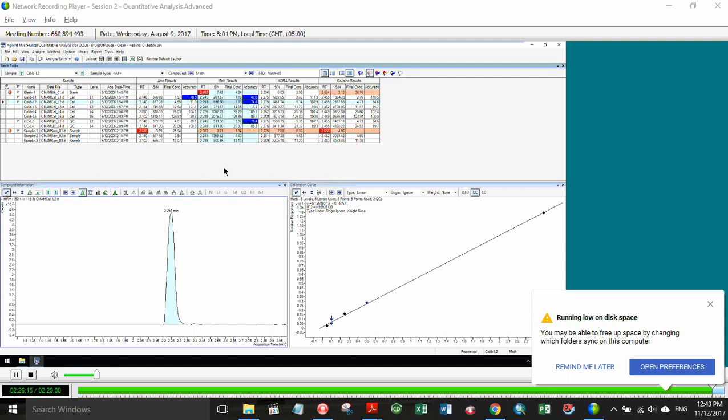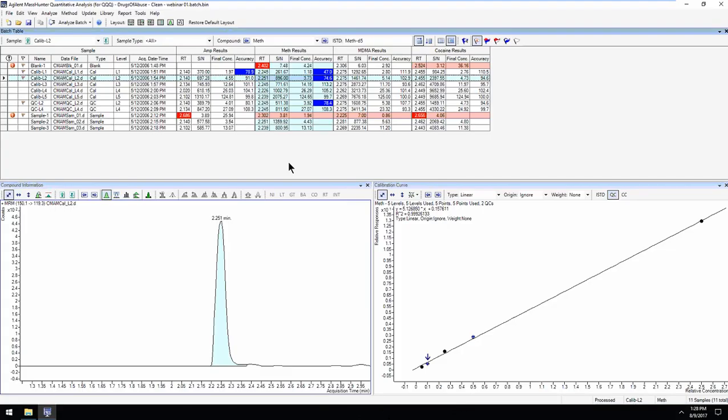Well, if I'm doing an extracted ion chromatogram, for example, in Howard's window here right now of an MRM transition, 150.1 to 119.3, I don't have to worry about any noise in that particular chromatogram because all I'm looking at is the 150.1 ion and the 119.3 ion. That's all that I'm looking at.